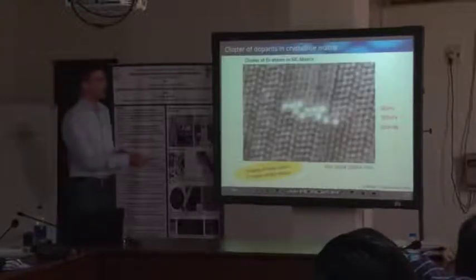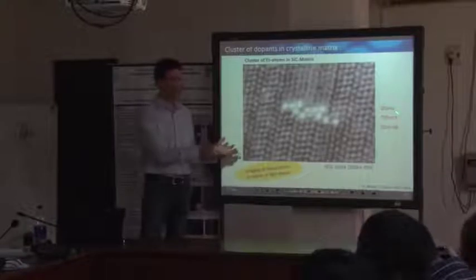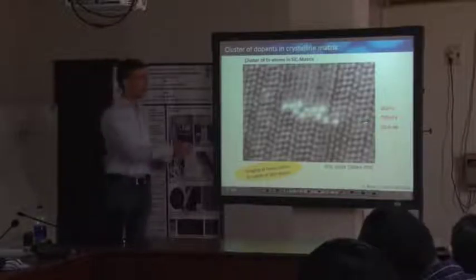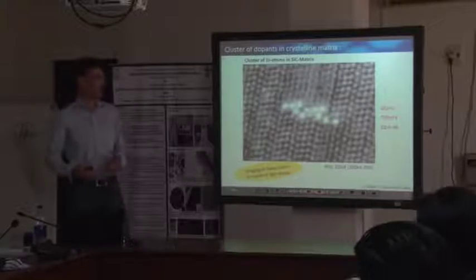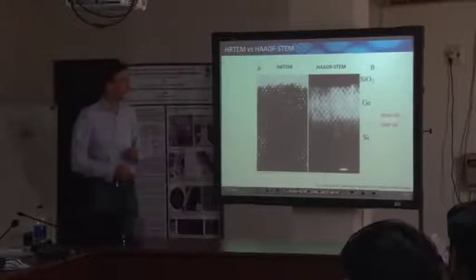Such an experiment is always easier if you have a clear chemical contrast, so heavy elements in a lightweight matrix. This is always a good case. Here is a comparison of atomically resolved TEM and STEM imaging.